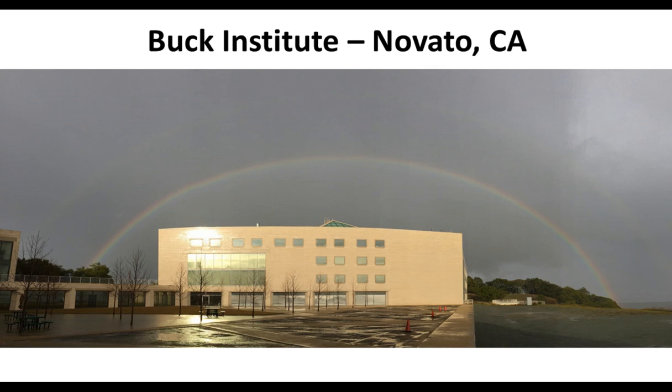Yeah, so I think Birgit is absolutely right, and I would just add that whenever we're preparing one of these PTM or motif antibodies, our goal is always the broadest coverage possible, or to generate something that really is context independent and only dependent upon presence of that PTM. All of these products are monoclonal products, but what we'll do is take clones that we get, test them via ELISA, or test them in PTMScan, and look at the peptides that we get out of each of those individual clones, and in some cases combine multiple monoclonal clones into one product.